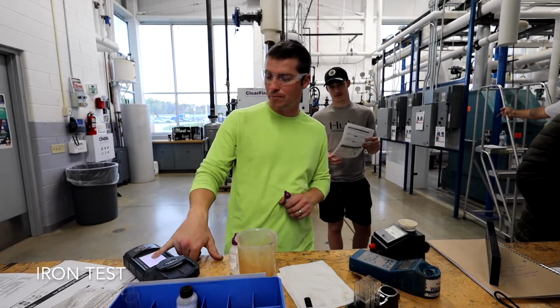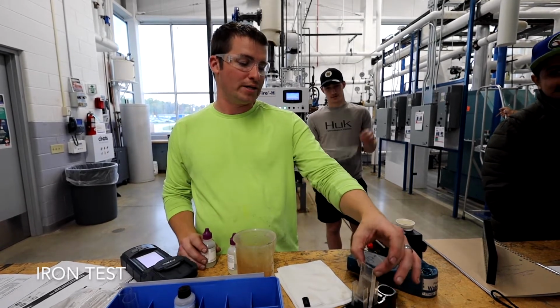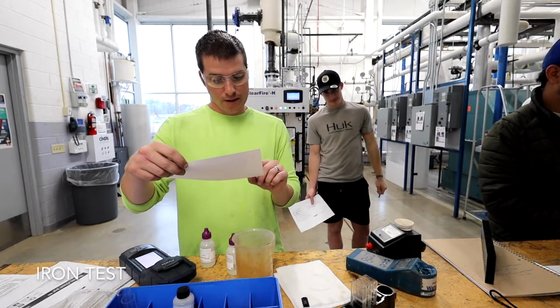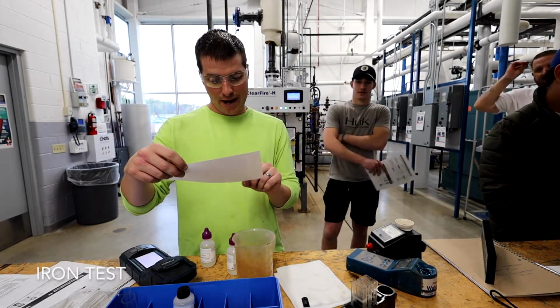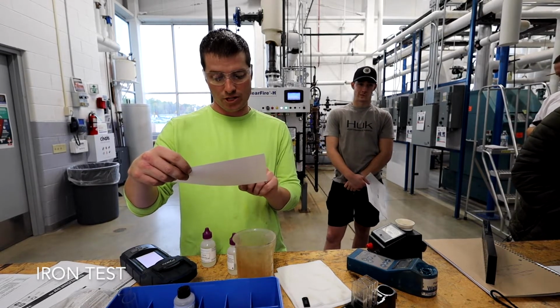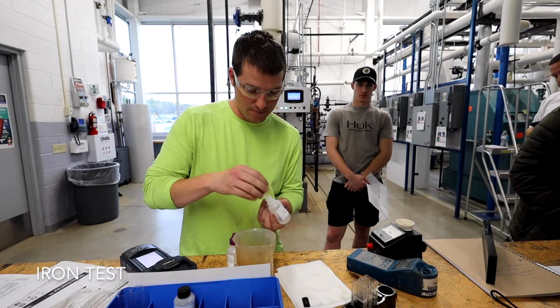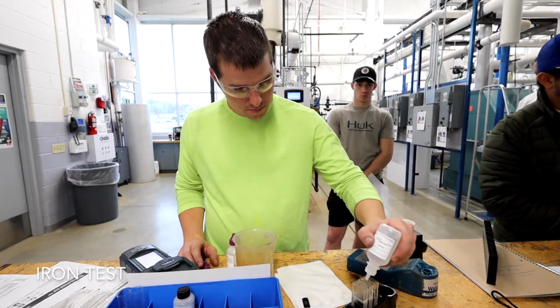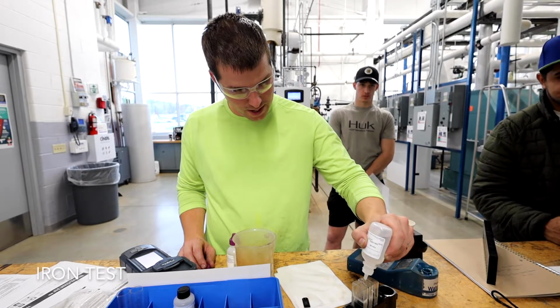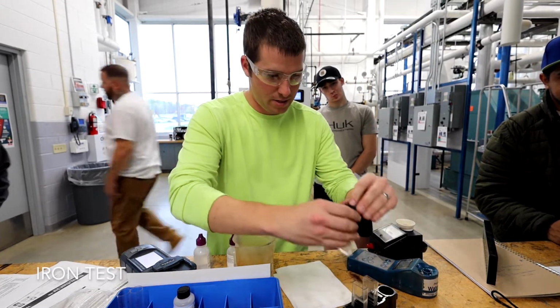So it's still going up a little bit, 0.51. It's probably been 4 minutes, so it's close enough. We're going to go to step 2. Step 2 is using a 1 mil pipette, add 1 mil of reagent number 2, cap and mix. That's going to be 10 drops: 1, 2, 3, 4, 5, 6, 7, 8, 9, 10. And then we're going to cap it and mix it.